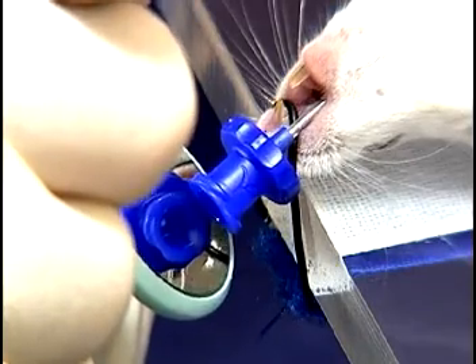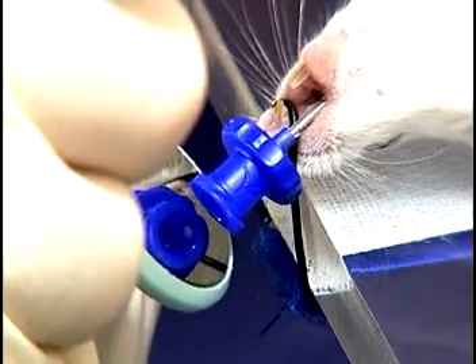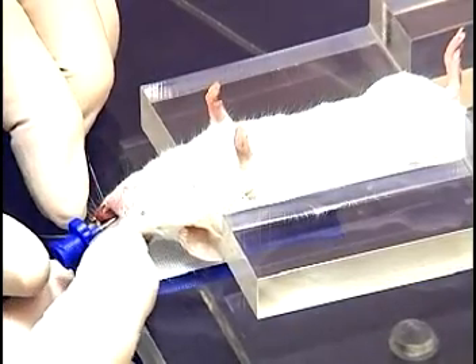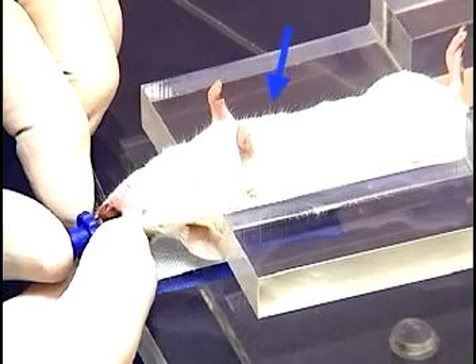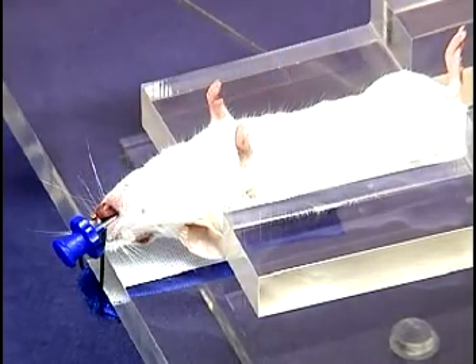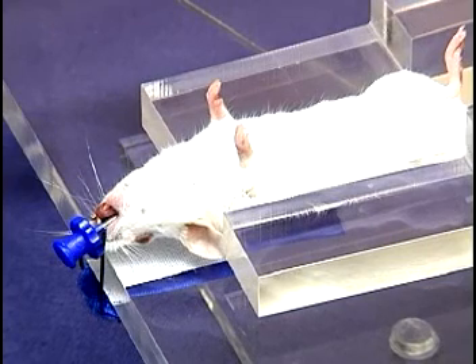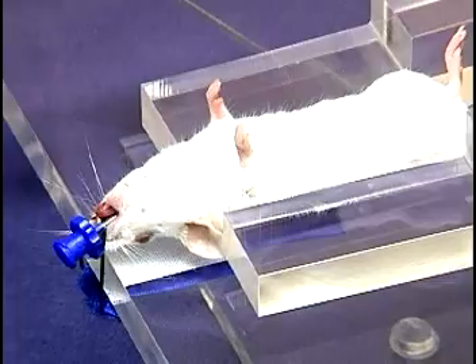The stand is now lowered and the tube is checked for correct position. A cooled mirror may allow direct observation of breath condensation. Or, if the tube is briefly obstructed, an abrupt change in the breathing pattern will be seen. If a misintubation has occurred, a second attempt may be made. However, if the mouse is to survive, no more than two attempts should be made. Trauma and swelling from repeated attempts can lead to respiratory obstruction and death.